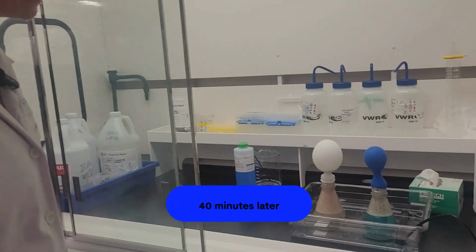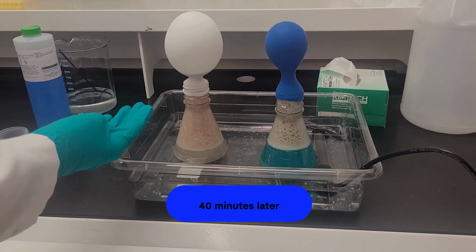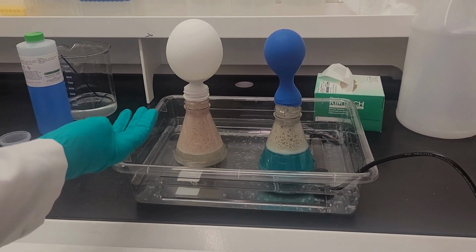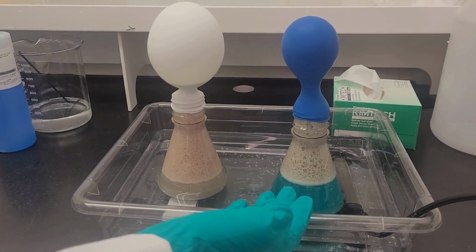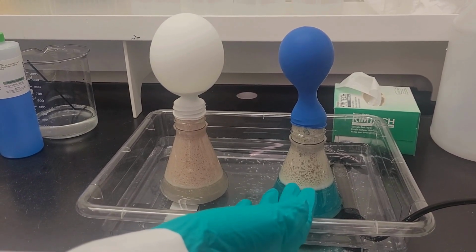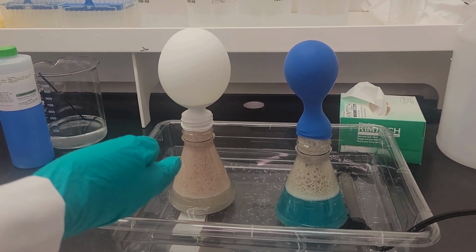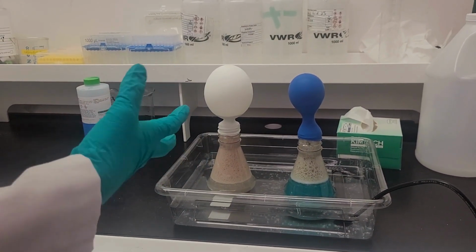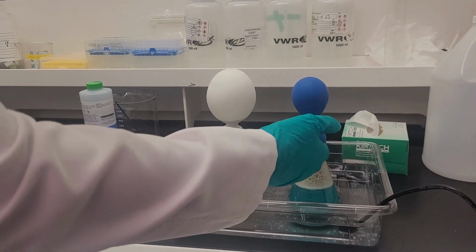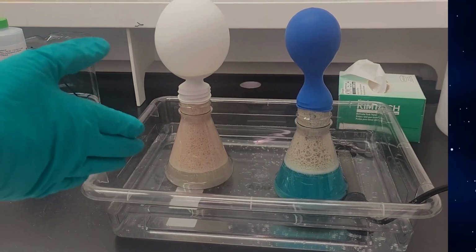All right, here we are 40 minutes in, and let's see how we're doing. As you can see, our healthy cells on the left-hand side are producing more carbon dioxide, and our unhealthy cells that have been exposed to a toxicant are producing less carbon dioxide. So the healthy cells are doing a better job with cellular respiration than our unhealthy cells that are being exposed to the toxicant.